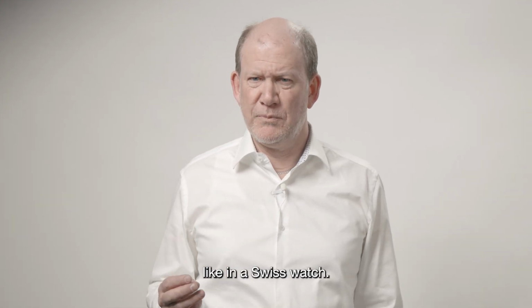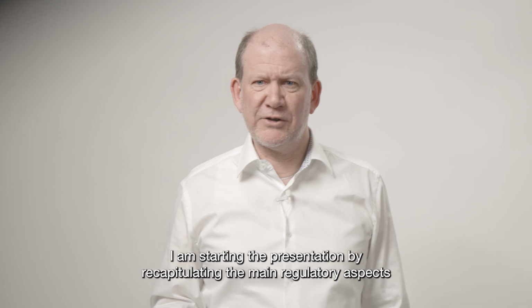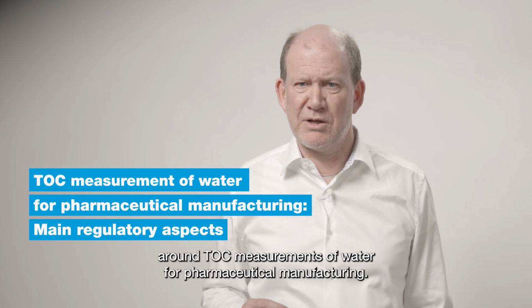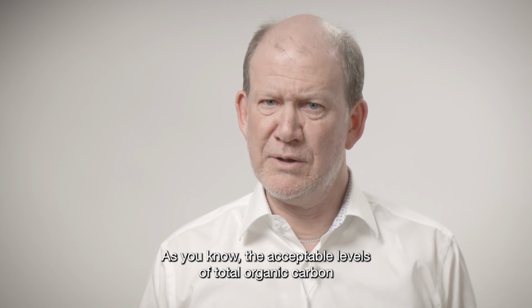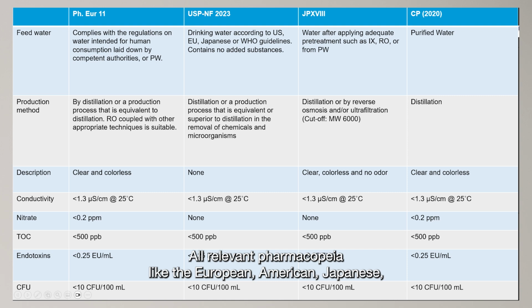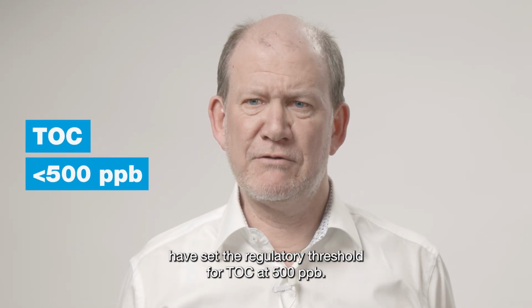Like in a Swiss watch, baby steps in the improvement of our products have proven to be more effective than giant leaps. I'm starting the presentation by recapitulating the main regulatory aspects around TOC measurements of water for pharmaceutical manufacturing. As you know, the acceptable levels of total organic carbon are defined in the pharmacopeia of the respective country. All relevant pharmacopeia, like the European, American, Japanese, Chinese, etc., have set the regulatory threshold for TOC at 500 ppb.